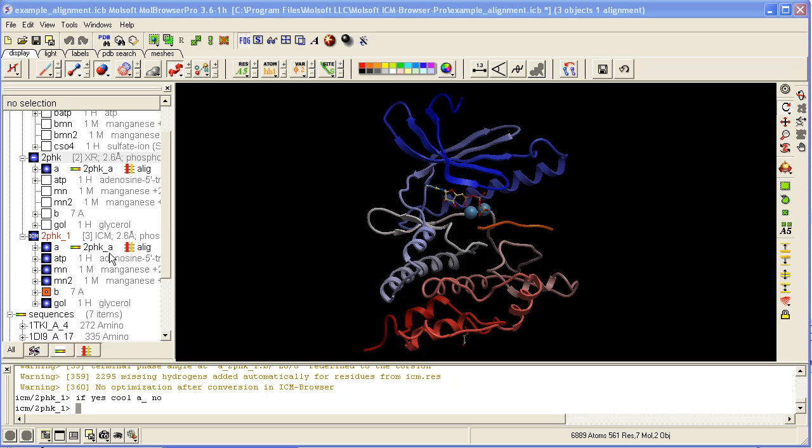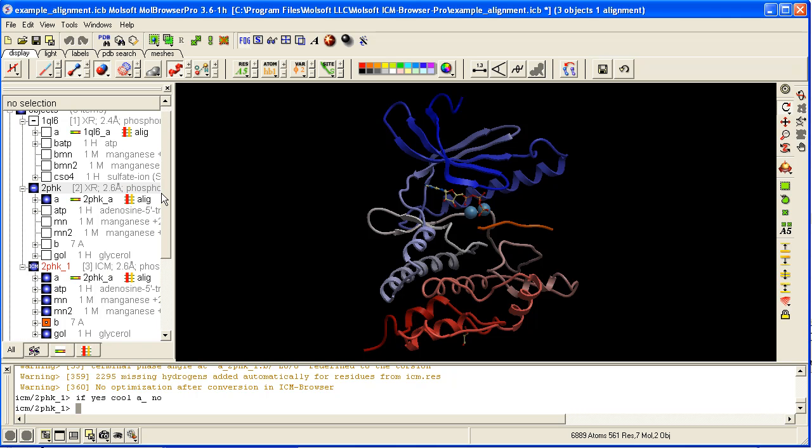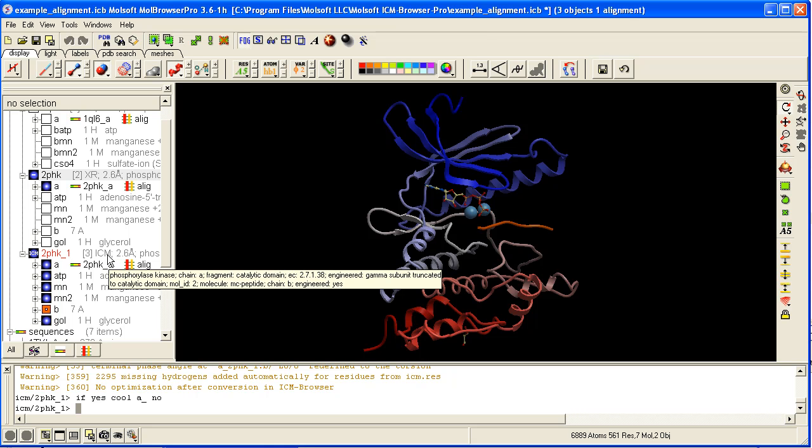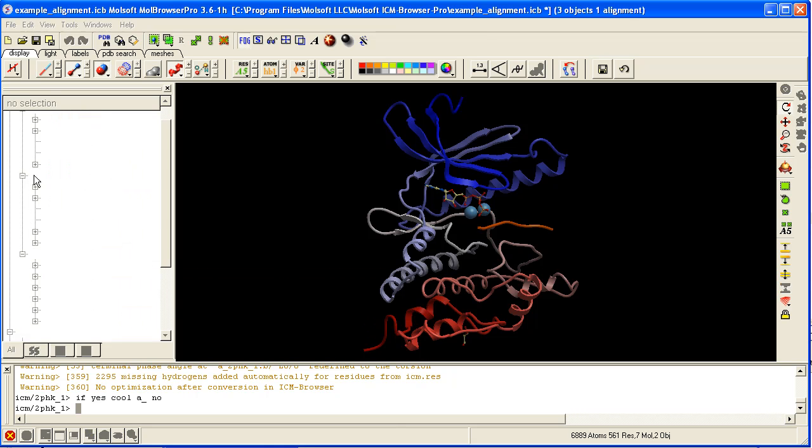Once the conversion is finished, if you chose not to replace the original, you'll have a new object in the ICM workspace with the name of the X-ray structure you converted, with underscore one. Next to it is ICM, which means it's now an ICM object.